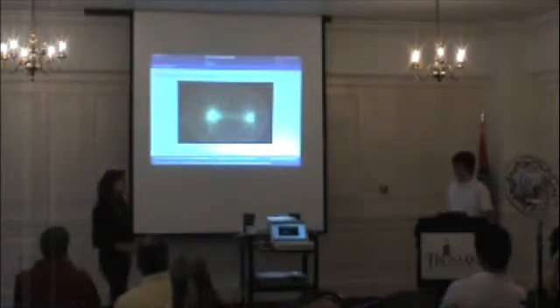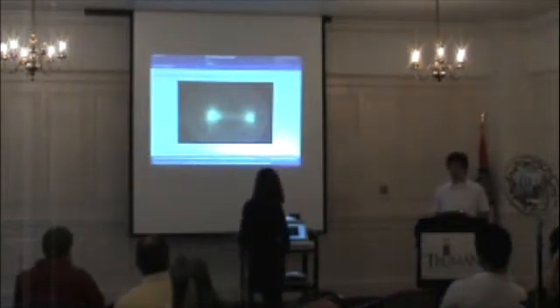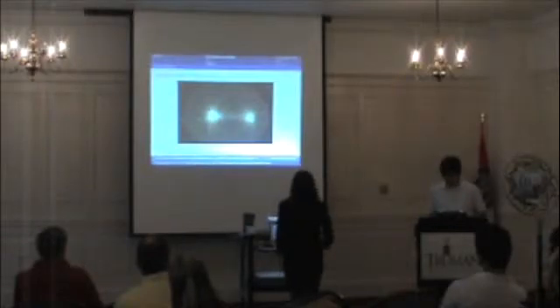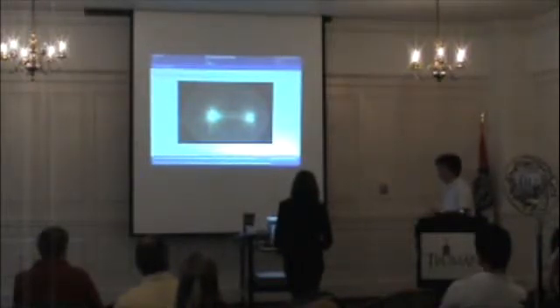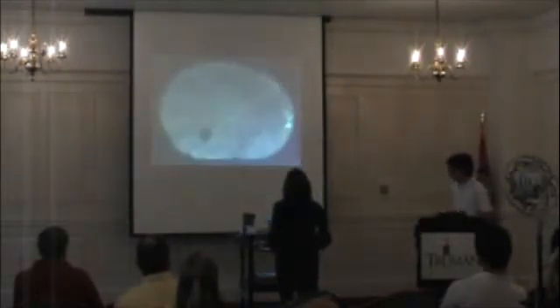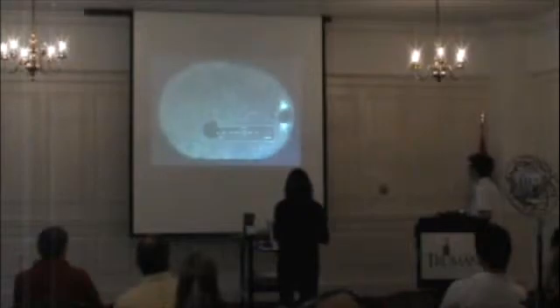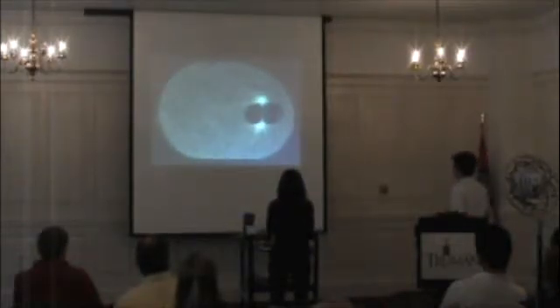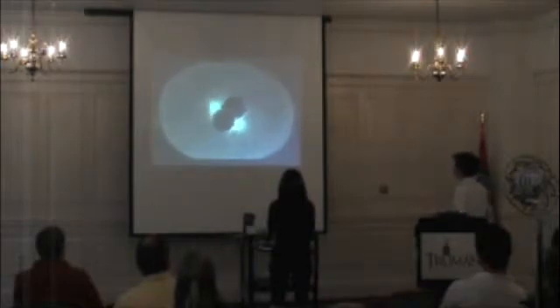Talking about the centrosome movement, right now, as I mentioned, the code just makes the centrosomes move as far apart as possible. However, what we need to do is model the centrosomes so that they follow a biologically significant pathway. And Ali's going to go ahead and play this video, and I'm going to talk about it as it goes. This is an image of a single cell, well, 2 pronuclei, the union of 2 pronuclei, sperm and egg, and the initial division of this embryo.